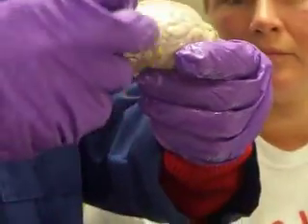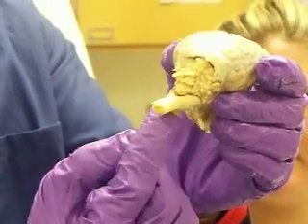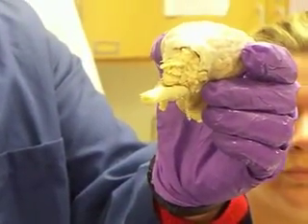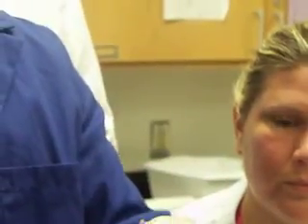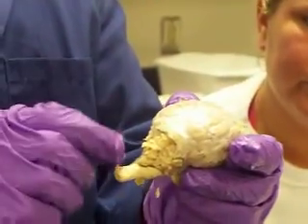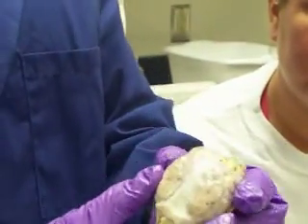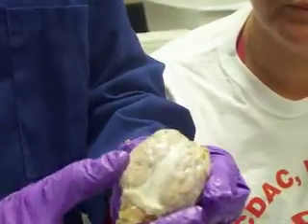In the case of a human, the cerebellum would be, if you could take it and move it this way, like this, and of course the spinal cord would be going this way, right? So this is very different. This is smaller in size, less developed. Cerebellum is more posterior than inferior, and the spinal cord is going this way. So we'd have to actually change it this way. But other than that, there are a lot of similarities between this and a human brain.